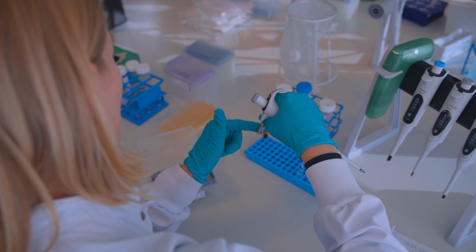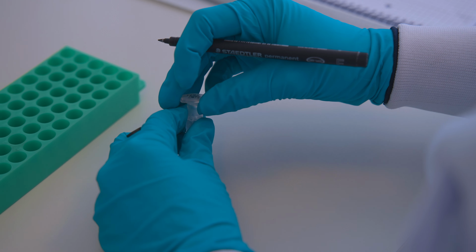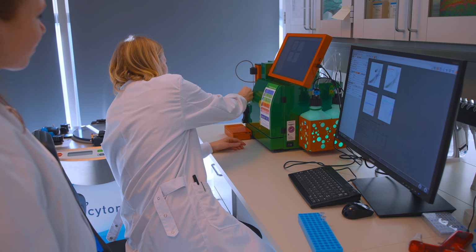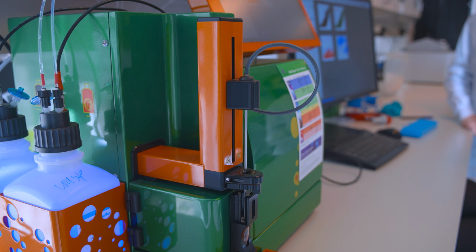The initial part of the project aimed to improve the isolation protocol by using alternative enzymes to the normal collagenases that we use in the Cytori device. This was done in collaboration with Novozymes, who selected a panel of 8 enzymes that we tested here at BlueCell to see if they would give more cells from the actual isolations. This did not fall out positive, because in the initial phase we actually saw more cells, but when we scaled up to the volumes we needed, they didn't really add anything.